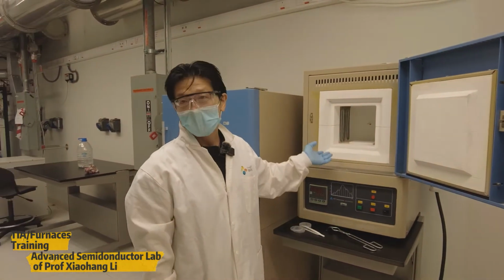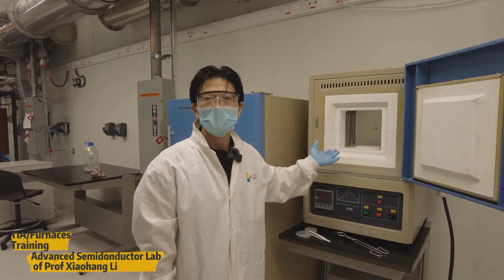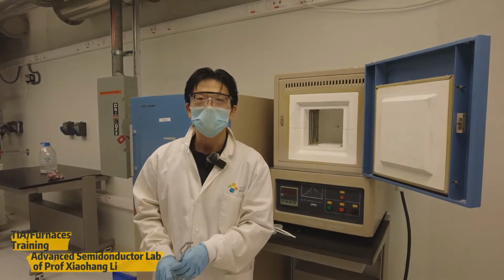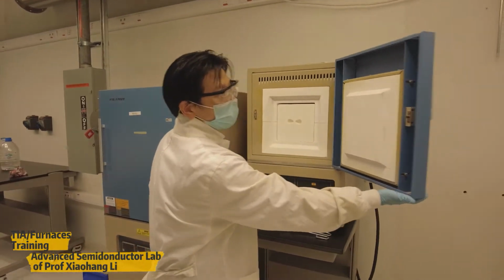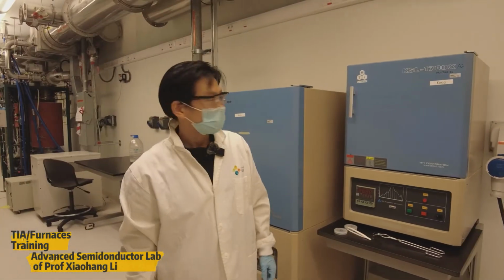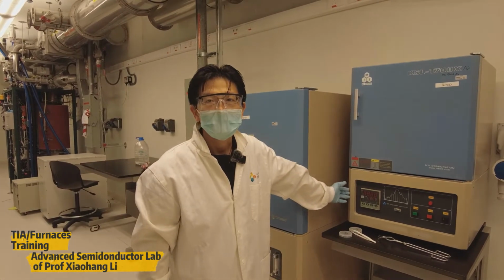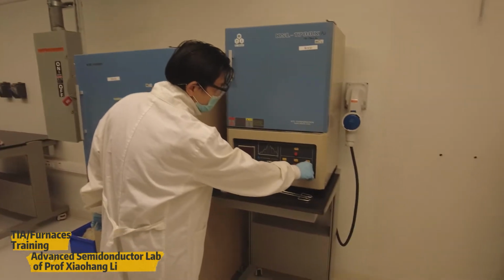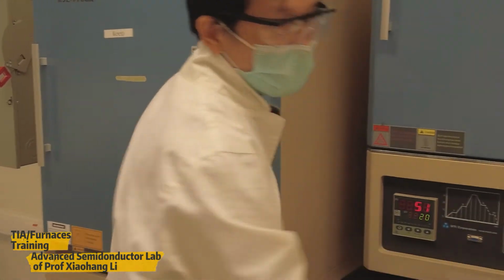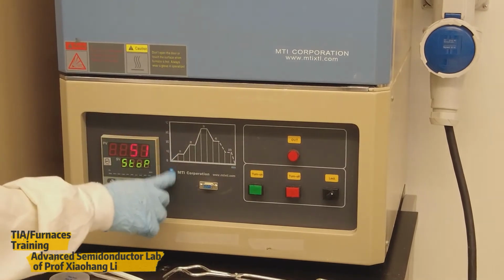Okay, now we have put our samples into the oven. We use another sapphire substrate to cap it. Then we'll put our shield back, then close the door. Right now we will start to do the programming to set our temperature curve. First of all, turn on the lock. Push the turn on button to enable the heater.